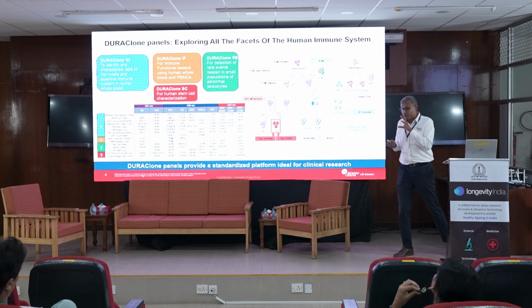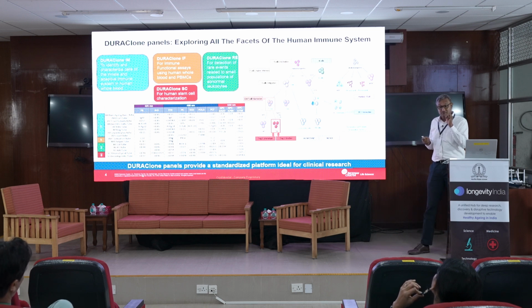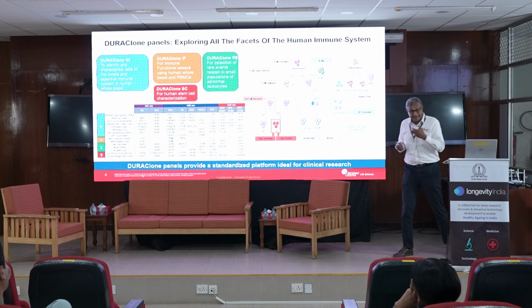Then you have the immune function tests. How are the immune cells functioning? Are they responding to stimulus in the same way? Is there a decrease in the response in the functional activity? Then you have rare events.